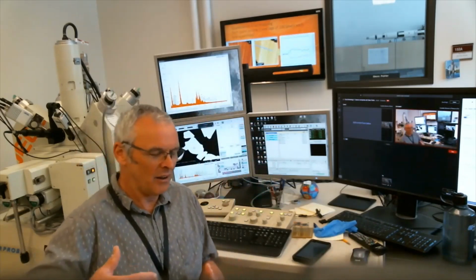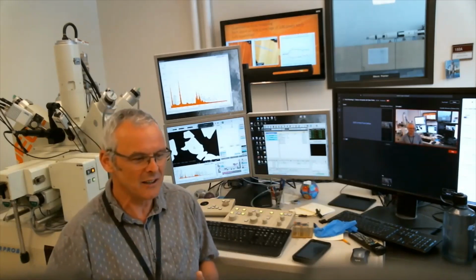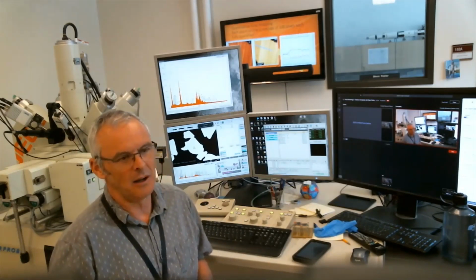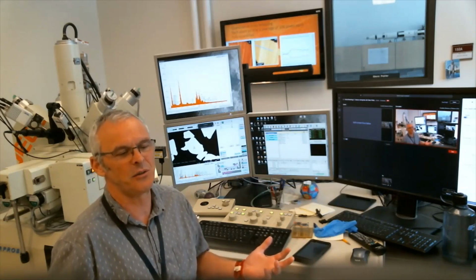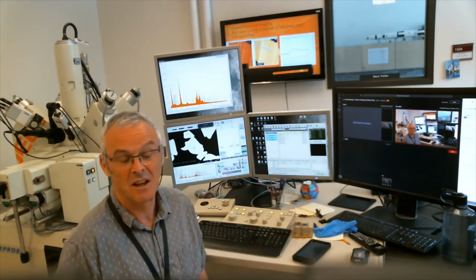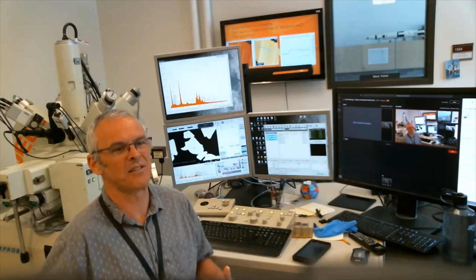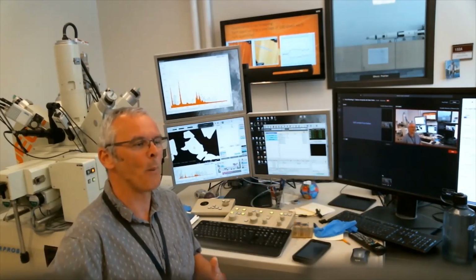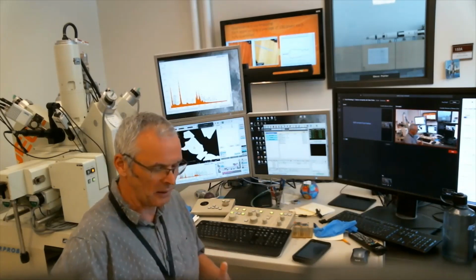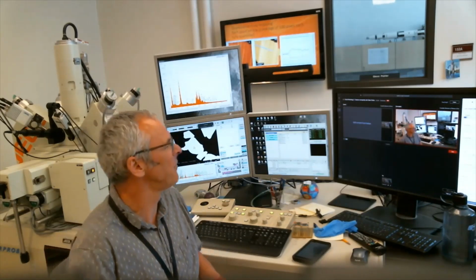Liz, analysis time depends on what you want. EDS analysis, 15, 20 seconds. On a probe, it depends on what I'm analyzing. If I'm analyzing, say, a feldspar, I can do an analysis in 2 minutes. If I'm analyzing something that's got all the rare earths in it, and I need to analyze all those rare earths, analysis can take 30 minutes. So it depends on what you're doing, how much accuracy you need, and what detection limits you need to have.